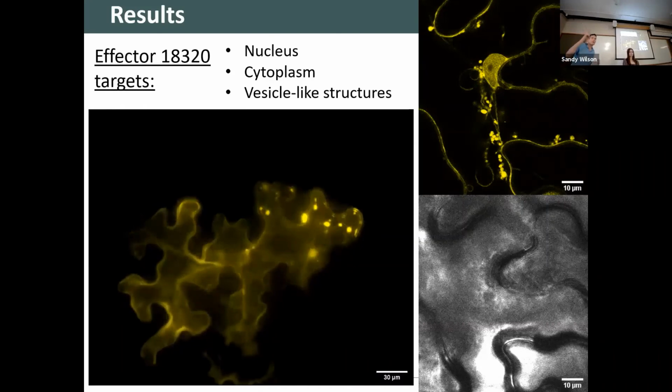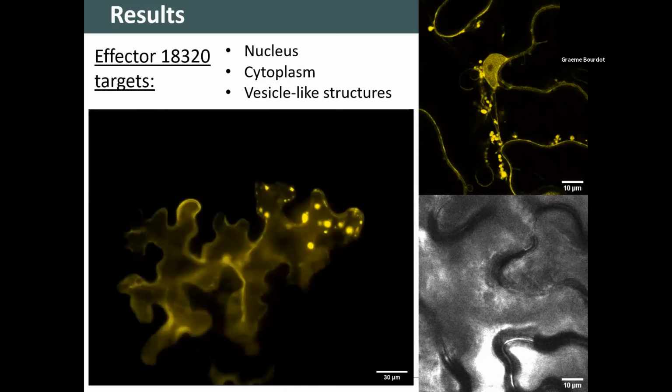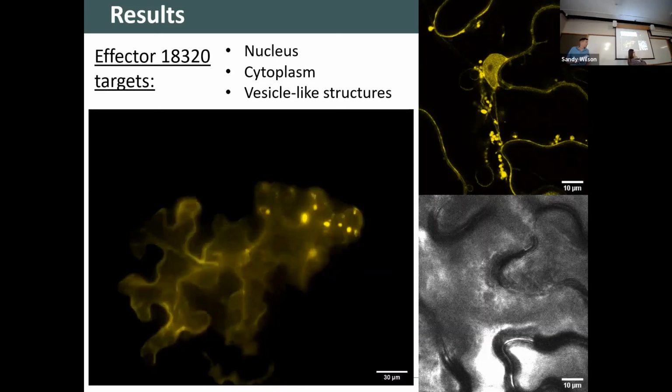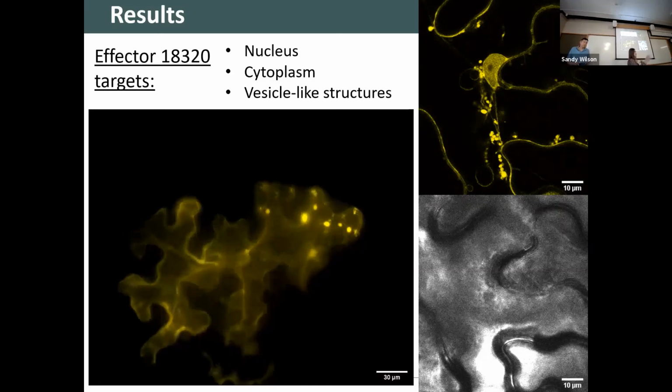Okay, we've got a question from the audience. Yeah, Jennifer. The fluorescence seems localized in these sort of long ribbon-like structures. Do you know what this is? Yeah, do you mean in the video? Well, in either video or the top picture. So the ribbon type things is the cytoplasmic streaming. So that's because it's localizing in the cytoplasm, and you can see it just moving along in the cytoplasmic stream there. It's not super strong expression, but I am working at the moment on doing a kind of control for confirming this using a red fluorescent protein and doing a co-infiltration to see if it's localizing in the same area.